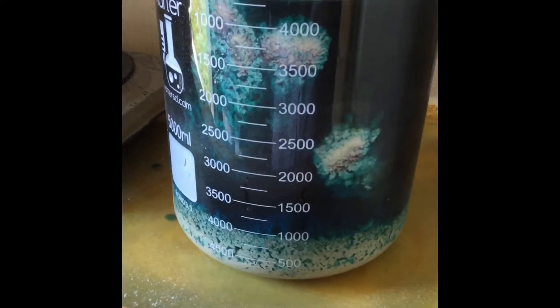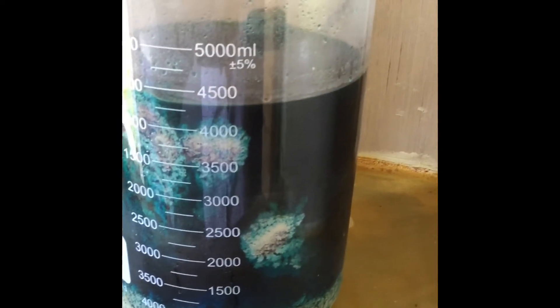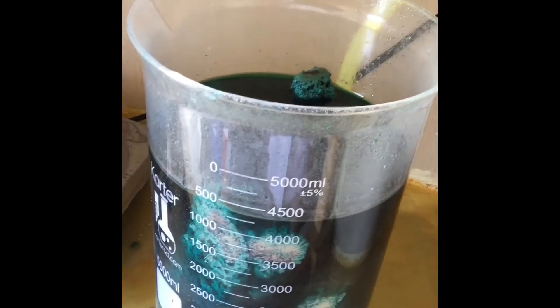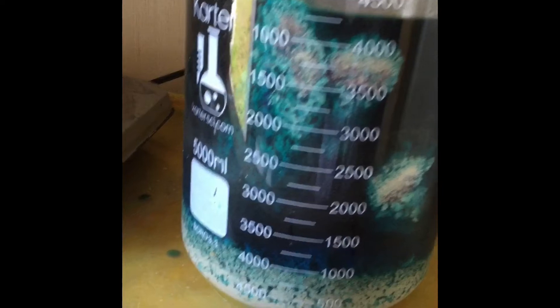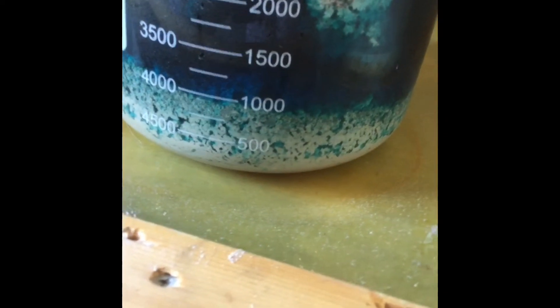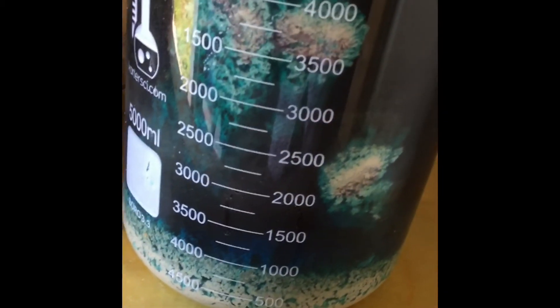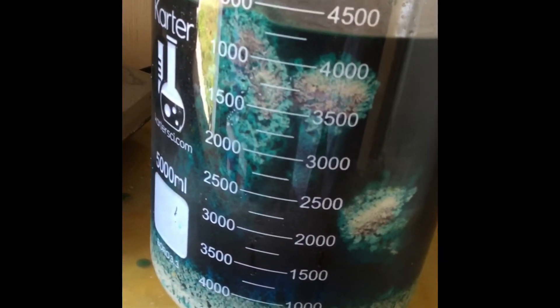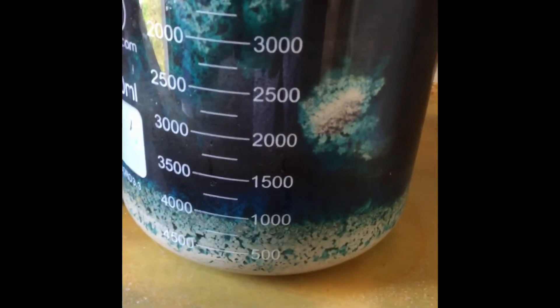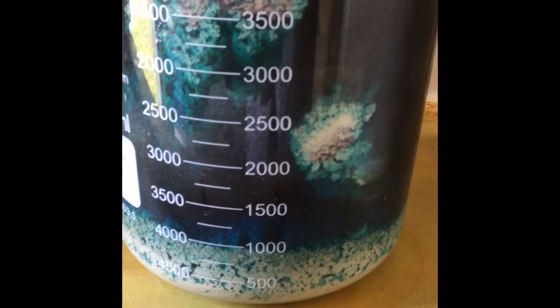This is after about a day and it looks like the reaction has totally stopped. There's still some copper left so I think we might have got all the silver cemented out. As you can see there's just a ton of silver down at the bottom, still crystallized on some of the copper. What we're going to do now is filter this out and just end up with a pile of silver powder.